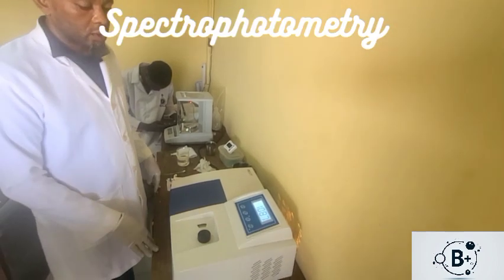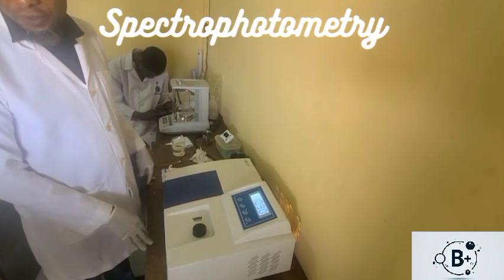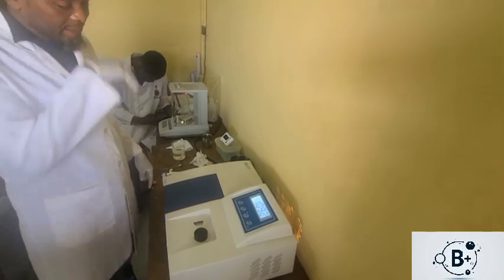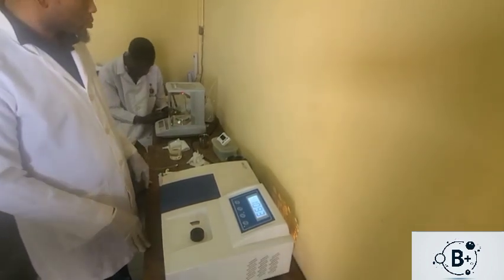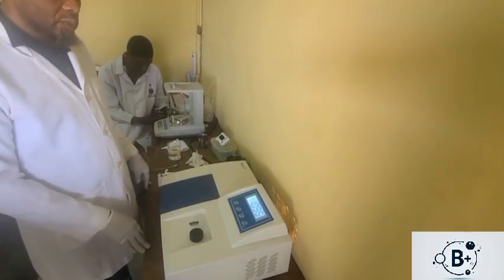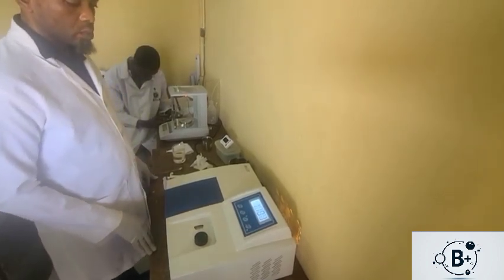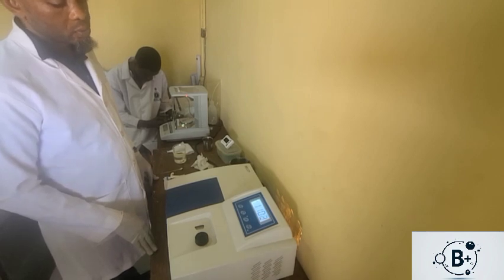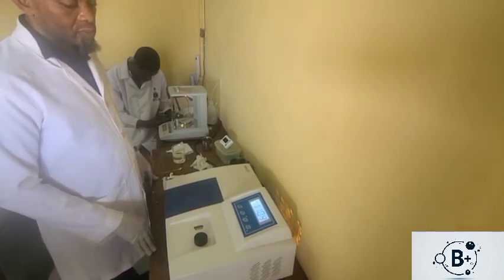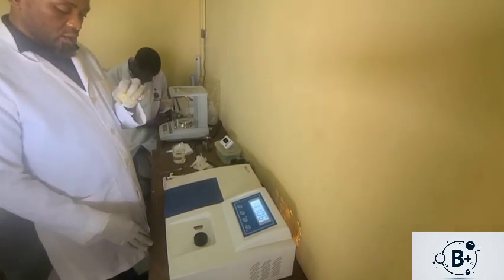Yeah, this is still okay, it's increasing. But we're having a different test now. So there may be some peculiarity with that group.